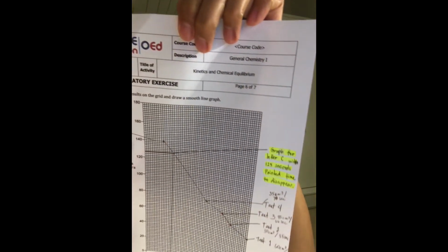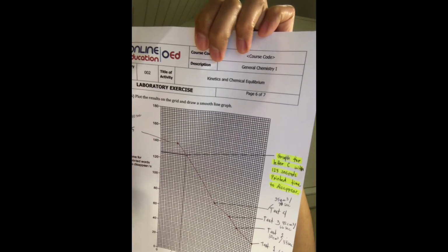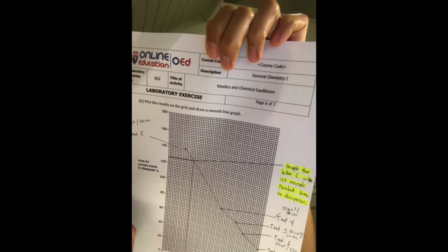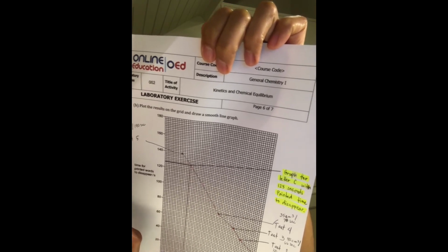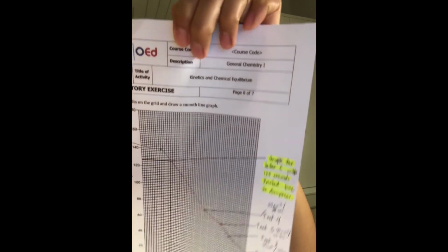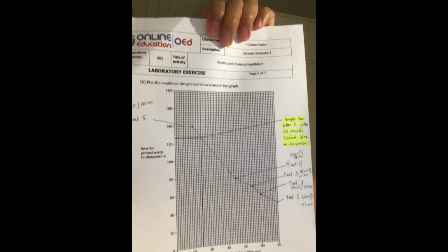And on test 5, you'll see that I have recorded 10 cubic centimeters with 140 seconds time for printed words to disappear.